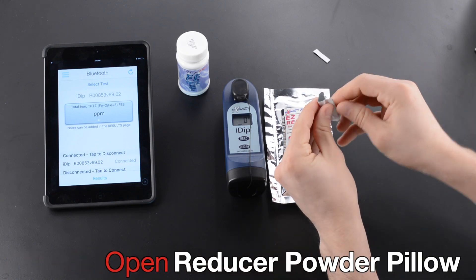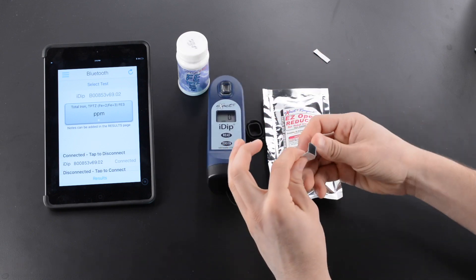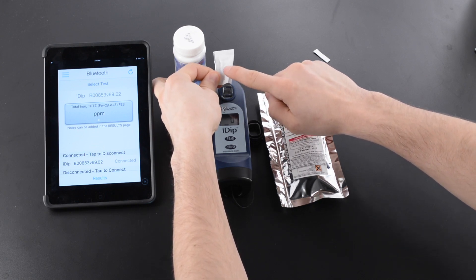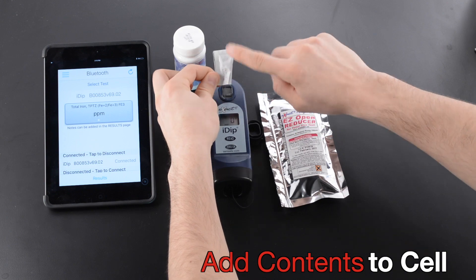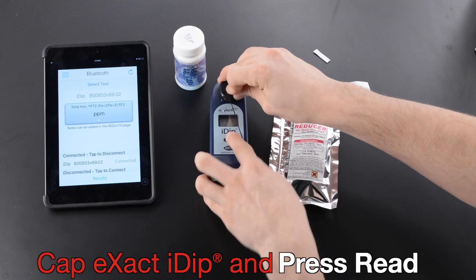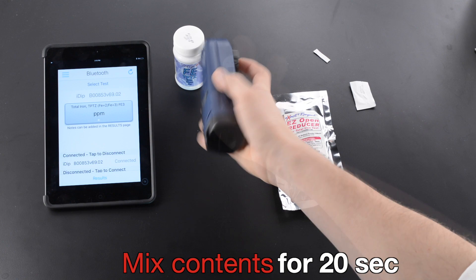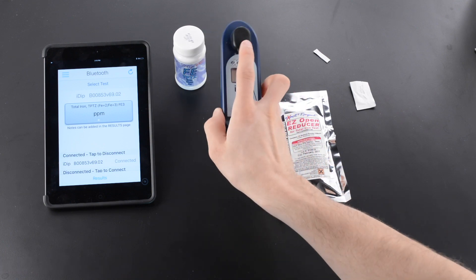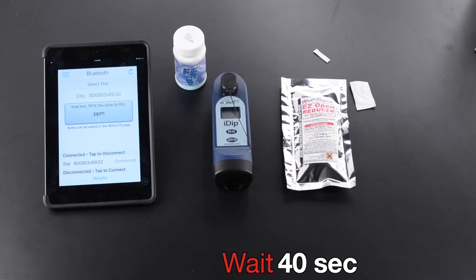Open Reducer Powder Pillow. Remove Cap. Add contents to cell. Cap XactiDip and press Read. Mix contents for 20 seconds. Wait 40 seconds.